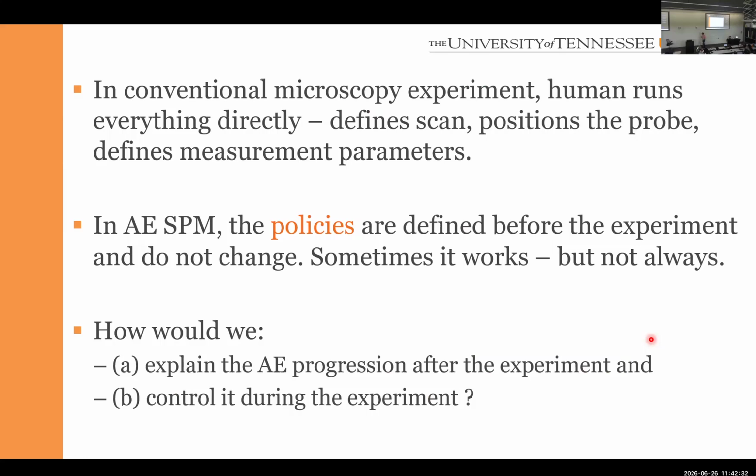So basically, we learned how to cast the microscopy experiment as an optimization problem. Practically, we have humans sitting in front of the microscope doing stuff and selecting what to study. In this case, we cast the optimization framework, meaning that we are no longer limited by human speed. We can run the experiment at the intrinsic speed of the microscope, and we can also run it much longer.